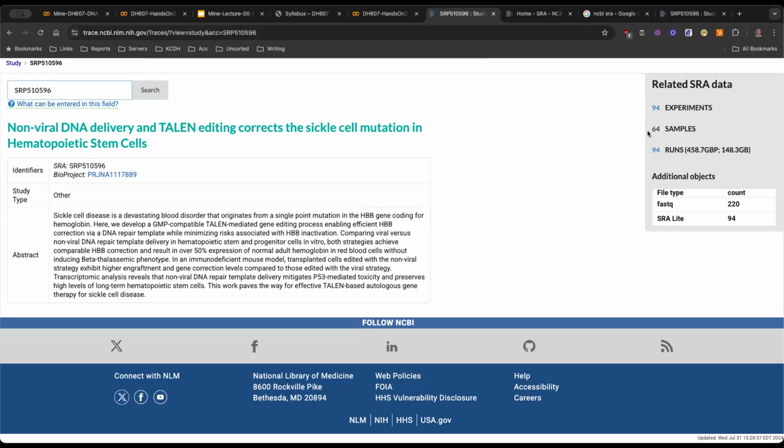That's experiment two. So the runs can happen for the same experiment. I did on day two a shallow round of sequencing with that sample, and then I repeated it again on day two with a much deeper round of sequencing. So that becomes a technical run. So that's a run. I will explain this in a new slide. Actually, next class, I should have done that. But very, very good question.